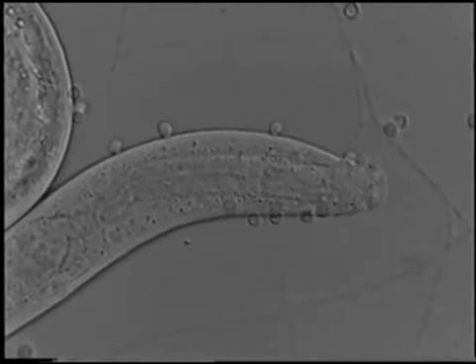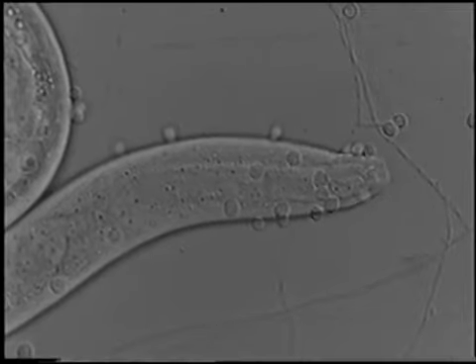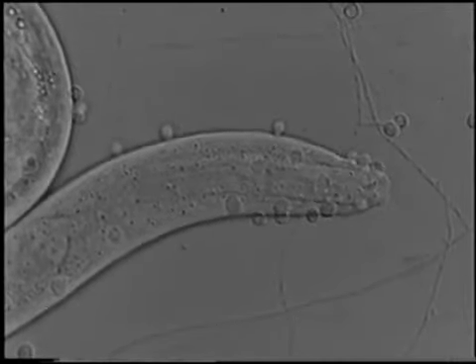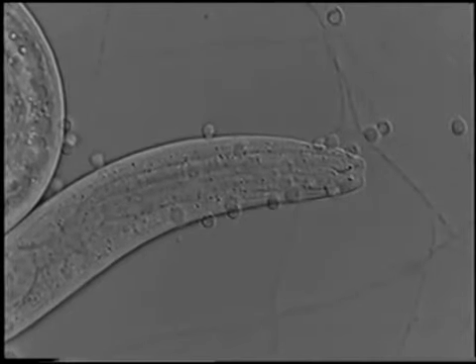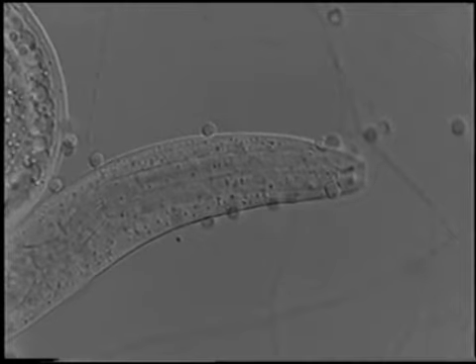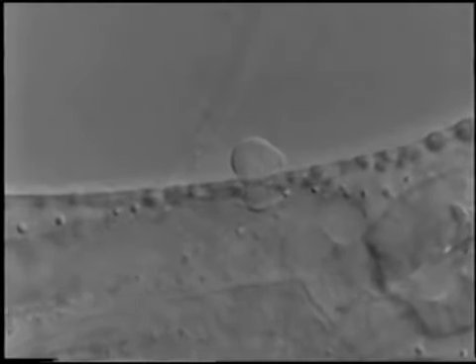Within an hour, the movements of the captured nematode gradually decrease. Whether the knobs are attached to the underlying mycelium or detached, the nematode cuticle is penetrated by a hypha. Inside the nematode, an infection bulb is formed.